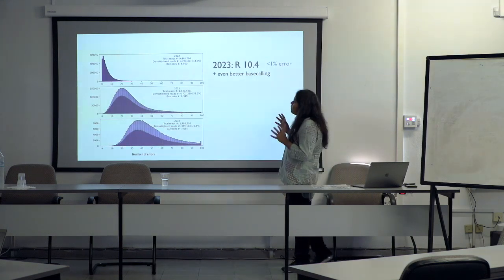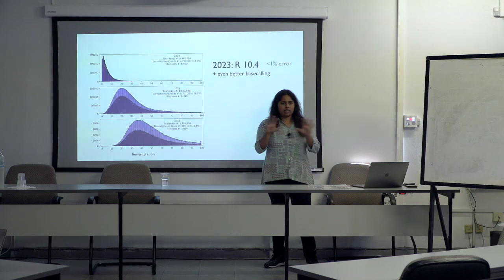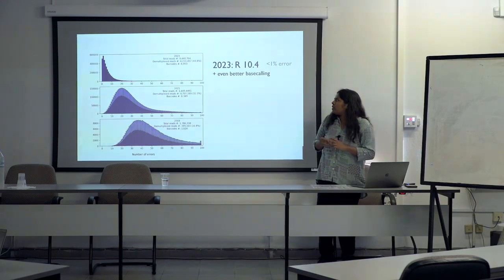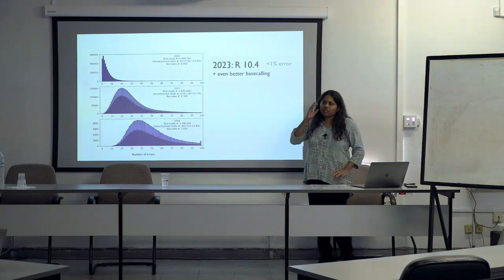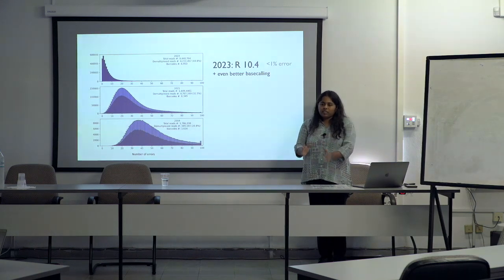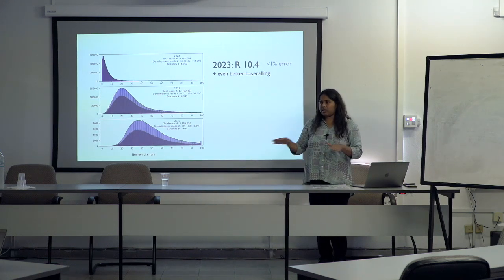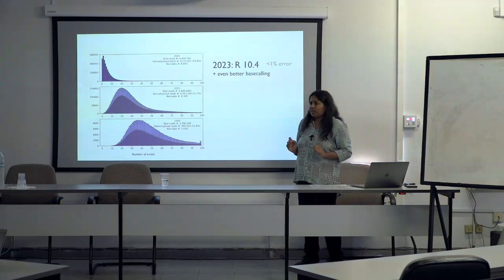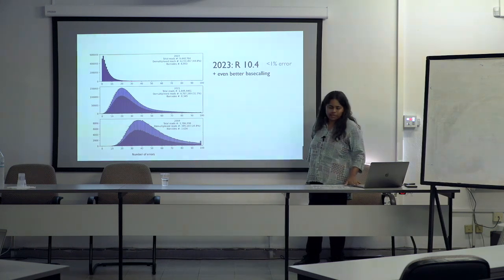So I think this is about it for the standard barcoding pipeline that we have. You can play with the coverage parameters if you want. I think usually we either do a 50x standard coverage or the iterative mode. We vary between these two, depending on how large the scale of the problem is.